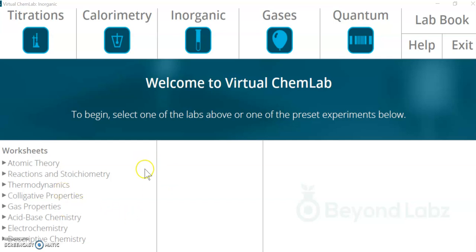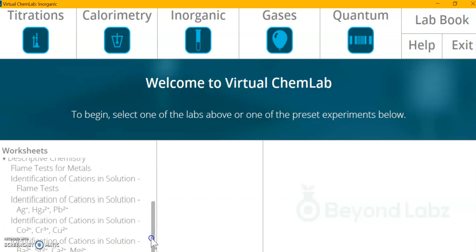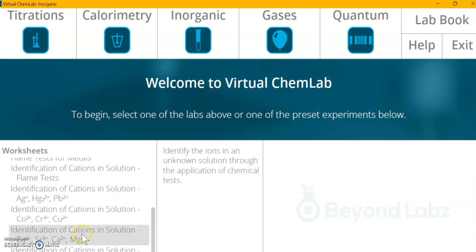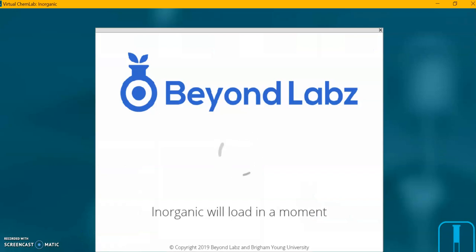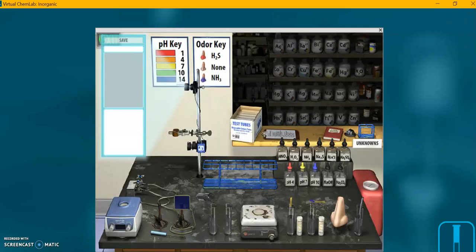I've already opened the virtual chemistry lab. I'm going over here to the worksheets descriptive chemistry. I'm going to scroll down here to the name of the lab and opening that up and here it goes.